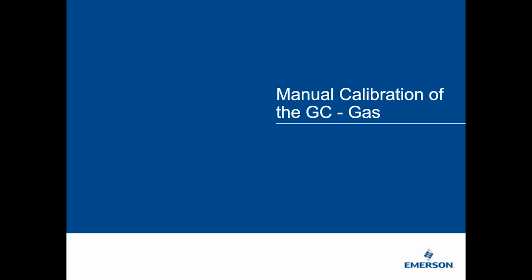In terms of Validate, we do have a webinar on that, and Validate is a little bit different from Calibrate, because with Calibrate you're changing the information related to the response factors. With Validate, you're just double checking to make sure the GC is functioning accurately and appropriately. And we do tell people to validate every 30 days to double check that. So it's a little bit different. With Validate, you don't change the response factors. You don't do all the purging. You're just checking to make sure everything is working appropriately. So the time frequency is up to you.